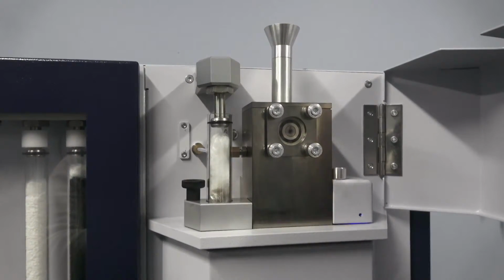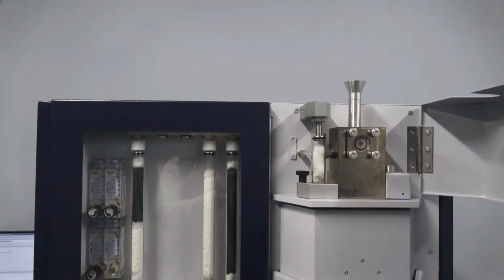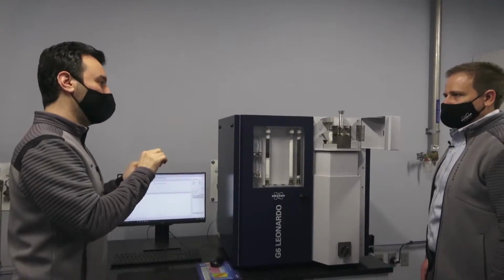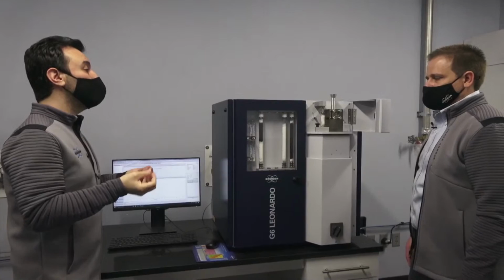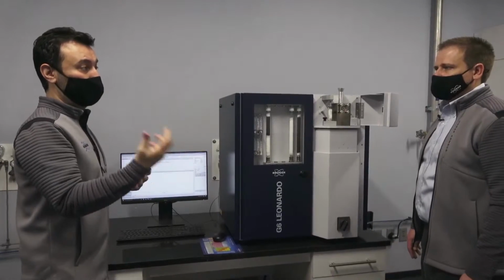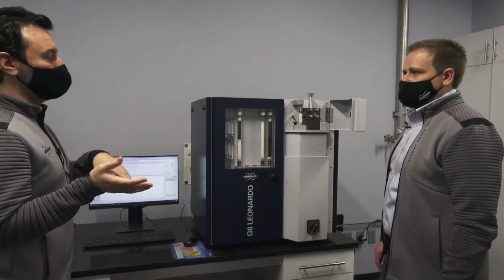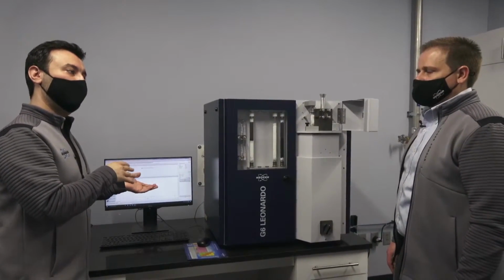It's heating up the crucible, using the carrier gas. In this case, we are using helium. It will outgas the graphite crucible, and then it will also check the baseline to see if you have a stable baseline. If everything is okay, when the time comes, it will drop the sample into the hot crucible. It will melt instantaneously and release those gases. Oxygen will form CO because the carbon comes from the graphite crucible, and nitrogen is released as molecular nitrogen N2. Then that CO goes to the infrared detector for oxygen determination, and nitrogen goes to the TCD, thermal conductivity detector.